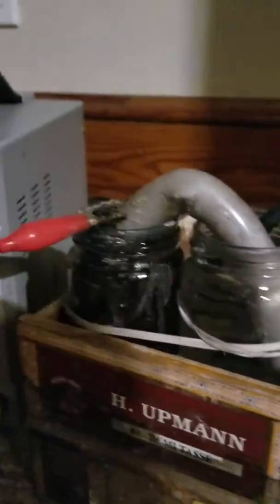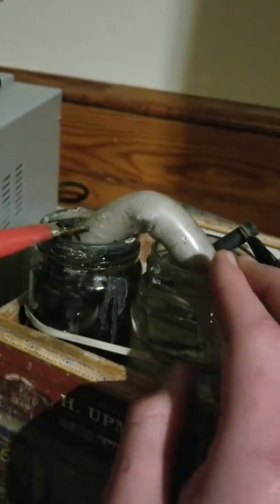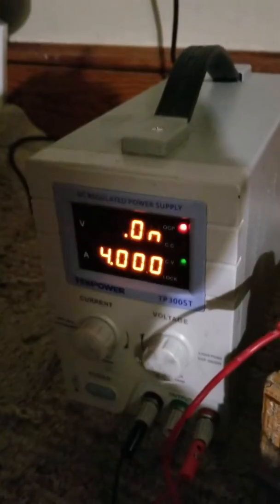First things first, welcome to my first video on YouTube. So right now I am doing a science experiment where I am converting baking soda — which is the stuff you've probably seen around your mom's kitchen — into caustic sodium hydroxide. The process I am using is electrolysis.